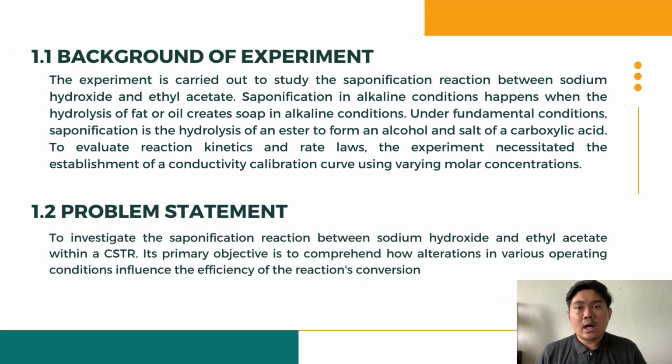First and foremost, I will explain the background of this experiment. The experiment is carried out to study the saponification reaction between sodium hydroxide and ethyl acetate. Saponification happens when fat is hydrolyzed to create soap in alkaline conditions. In other cases, saponification is the hydrolysis of an ester to form an alcohol and the salt of a carboxylic acid. The experiment necessitated the establishment of the conductivity calibration curve using varying molar concentrations.